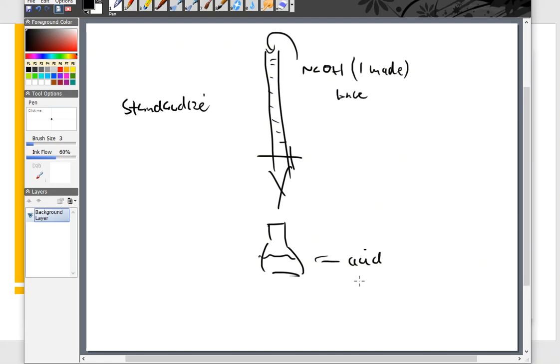We typically do not like liquids or solutions of acids. Their concentrations can be a little weird. Their concentrations can change. Even the sodium hydroxide that I make today will change next week. It will change slightly. So very often we have to standardize typically the day that we use it, and it will only be good for probably that day or the next day. And then we like to standardize again because they do constantly fluctuate on us.